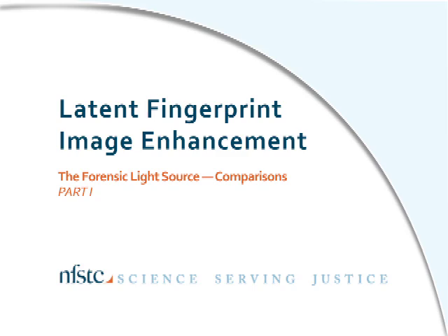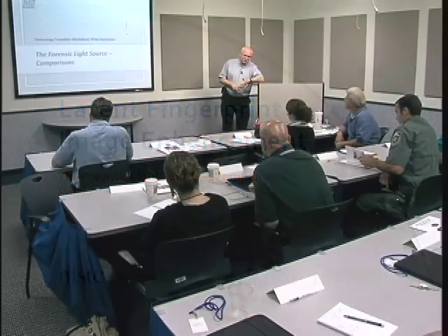We talked about the inception this morning. We talked about some of the evolutionary developments as things got refined and extended. And so we are sitting here in 2009 with a bunch of options that have all evolved out of the first argon ion laser to be used.